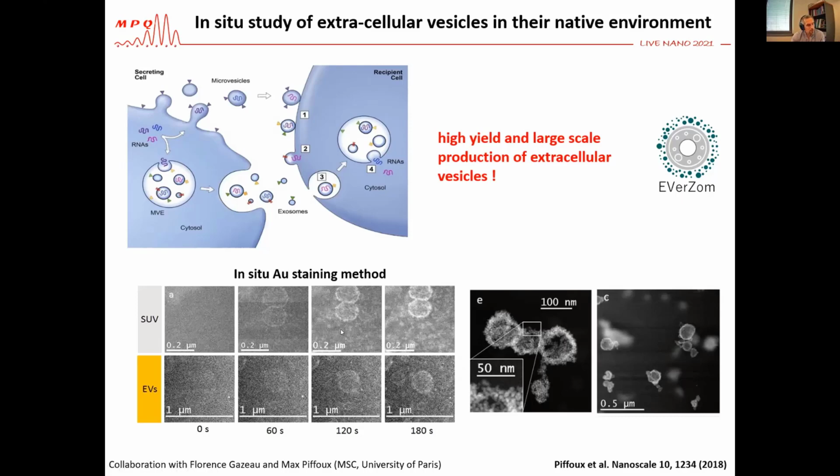And you can stop the process whenever you want by reducing the dose. And once their contrast is satisfactory, you can image their morphology and their dynamics. So it's very useful to image light materials, and I think it can be used on many other low contrast materials in the liquid cell.